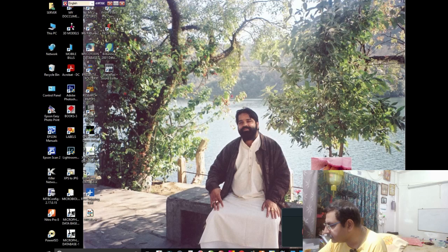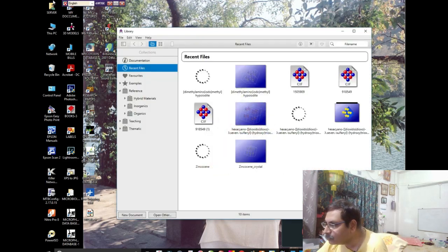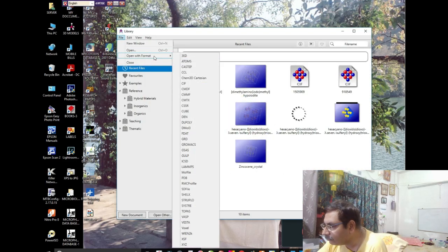Now we will go to the CrystalMaker. This CrystalMaker is ready to open that file in the SD format. So here we have to choose File, Open, in the format of MOL file.